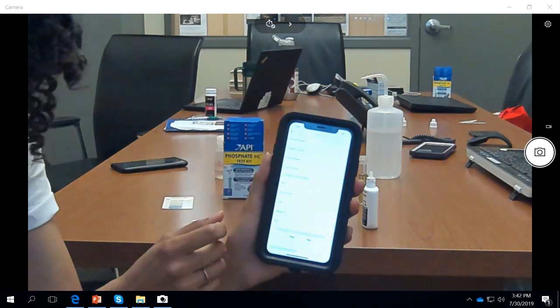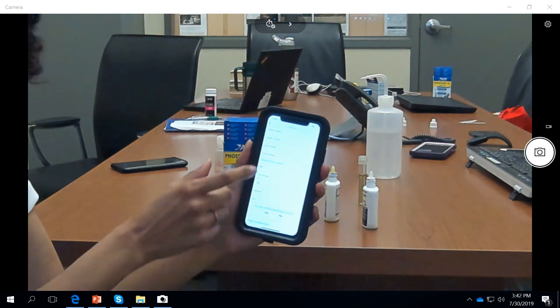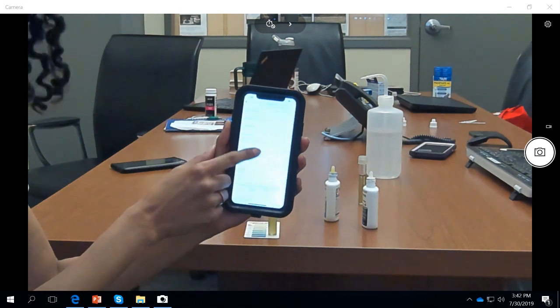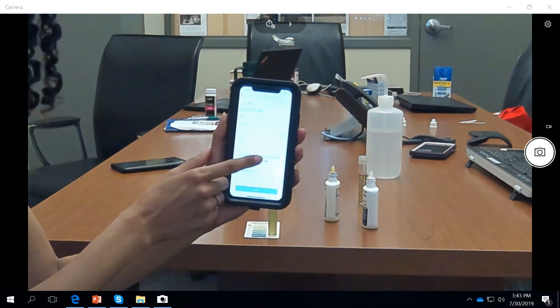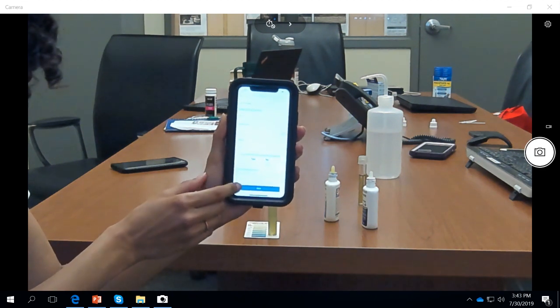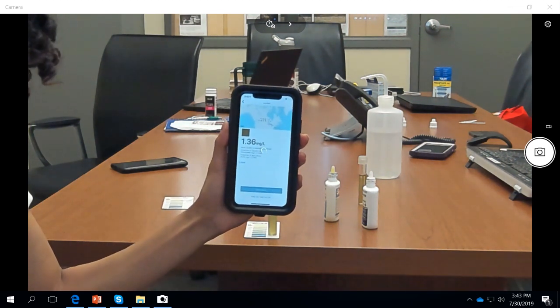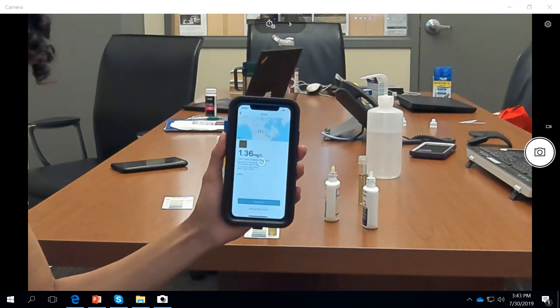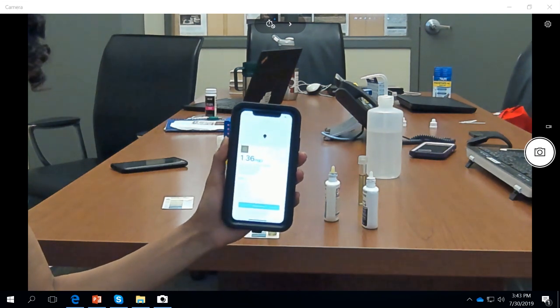Then enter in your light conditions, temperature conditions, where the water was sourced from, as well as if you're at the location during testing or not. For example, indoor bright, from a lake, no for sampling location, and you may choose to enter the temperature, and then you can go next. And from there you can obtain a reading. So in this case, once it's done loading, you can record the measurement, and we're seeing 1.36 milligrams per liter of phosphate.